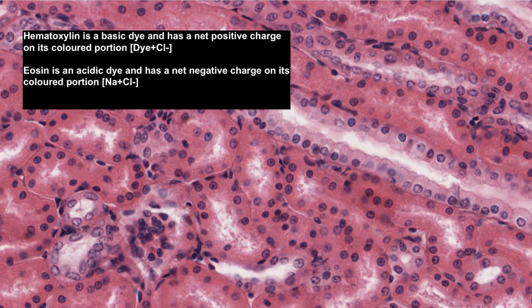Let's now look at the basis of hematoxylin and eosin staining, which we often abbreviate and just say H&E.